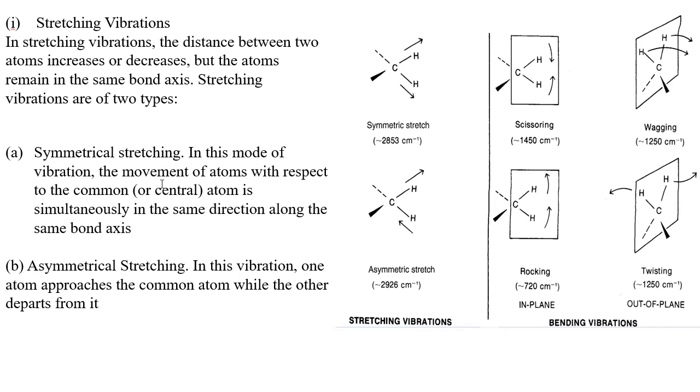In symmetric stretching, the movement of the atoms with respect to the common atom, here the carbon atom or the central atom, is simultaneously in the same direction along the same bond axis. It is symmetrical stretching.